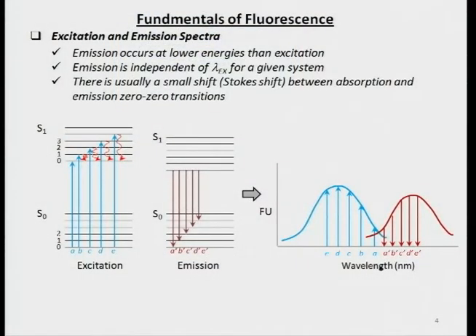For example, we want to use this particular wavelength in the affinity experiment. We decide on what wavelength to utilize, and then we decide on what wavelength to monitor the conditions. So we are deciding on a wavelength here and a wavelength here. This is the excitation wavelength and this is the emission wavelength. The excitation wavelength and the emission wavelength remain constant in that particular experiment. We are simply monitoring the changes in the fluorescence intensity.